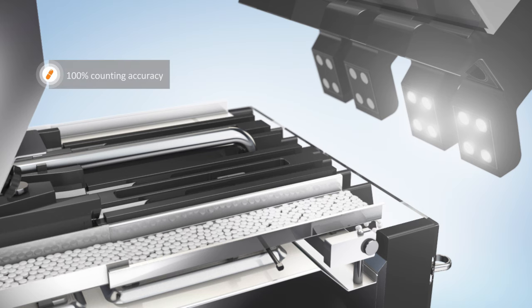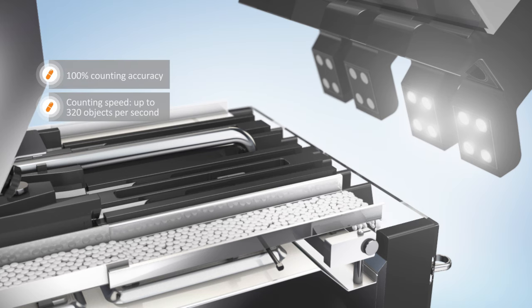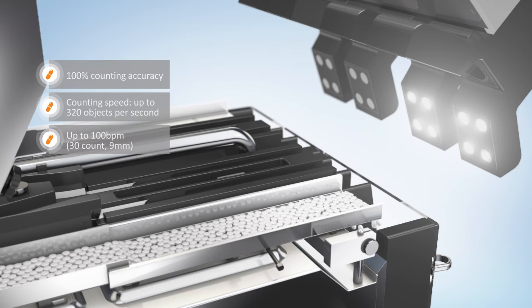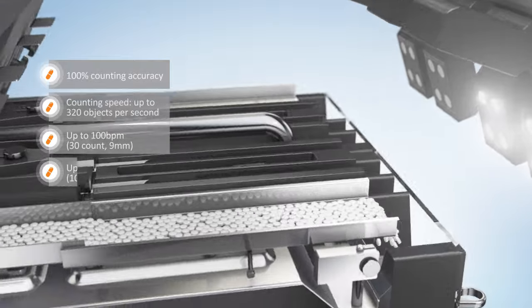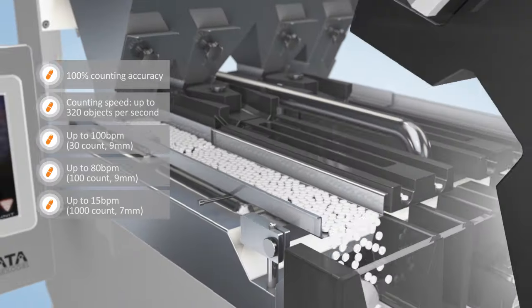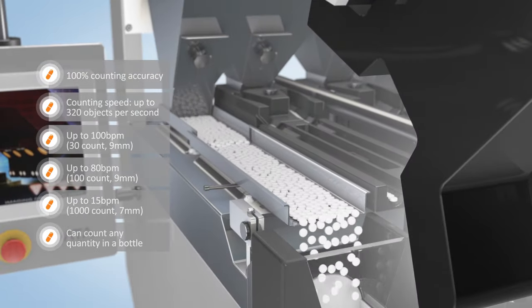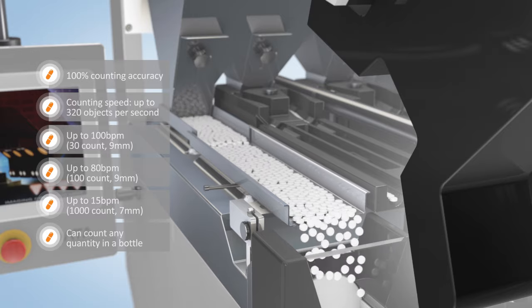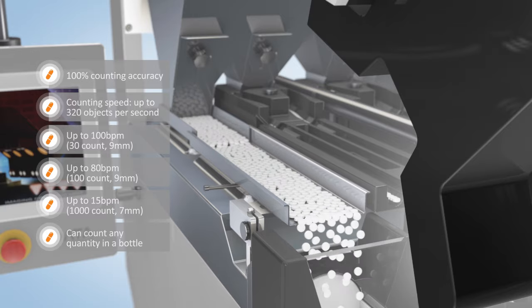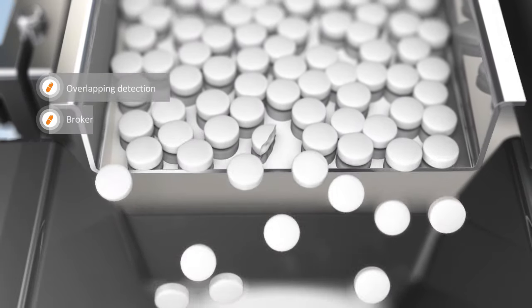Tablets are fed onto a high-speed wide track and carried to a wide detection area. Tablets are monitored by a bulk vision unit while falling, enabling high-speed counting with minimum breakage during the feeding process.